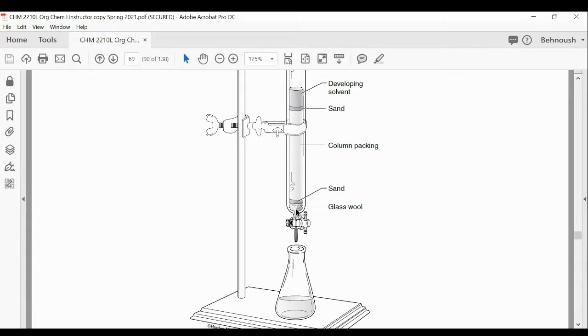Can you tell me, especially if you have not answered any questions? I can go to the chat room and see who has not answered questions, but you can tell, you know it already. If you haven't answered the question: what is the purpose of using glass wool when you are preparing a column for column chromatography? Use of glass wool. Craig, I think you answered questions. Antonia? Anand? And Maria, could you tell me what's the purpose of using glass wool?